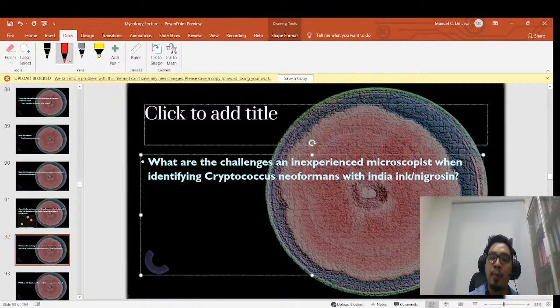I will interview some of the people in the chat room because we want to have a little conversation with you guys. Since Francis already said something, I'd like to ask Francis: what would be the problem if you are an inexperienced microscopist presented with the challenge of identifying whether or not a sample has Cryptococcus neoformans in it via India ink preparation?